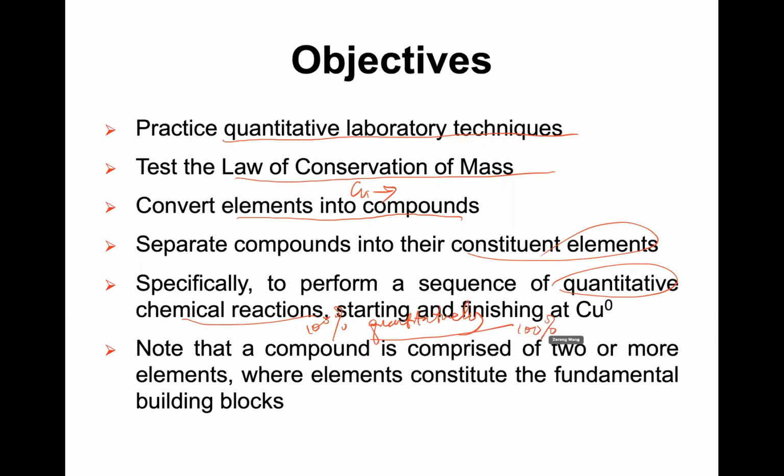But saying that it is 100% is not a guarantee we have 100% of the mass recovered because, for example, when you do the filtration, here we use a Buchner funnel and we put it on a flask attached to vacuum. And you use a filter paper like this one.